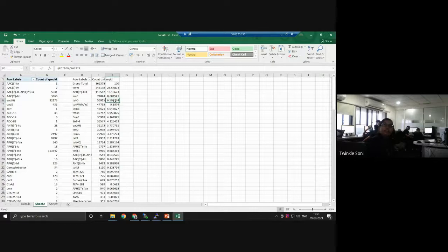If you have any query till now, please do let me know. Now in the next session, we will see how this table can be viewed using STAMP, and statistical analysis over it. So any question?